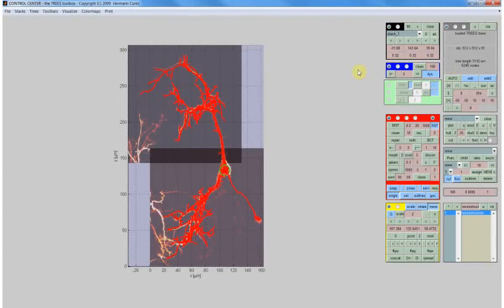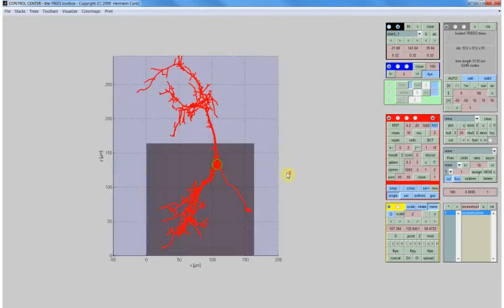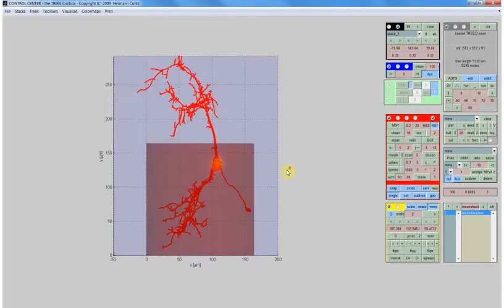So two things are particularly noteworthy. One is that when you go into the slicer mode, when you have a single slice representation of the data, then occasionally single slices are skipped in the representation.